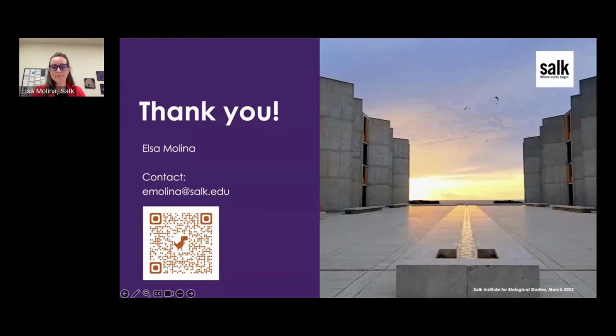We've had another question that's a bit of a follow-up to the one on why choose spatial transcriptomics over other methods. And that is, can you easily integrate spatial transcriptomics with other omics data types, such as single-cell RNA sequencing or proteomics? Of course, yes, of course. You should always confirm your data with another type of technology.